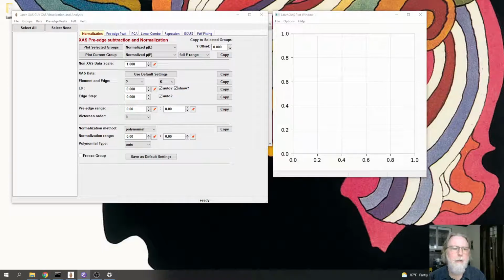One of the most convenient ways is to start with a crystal structure. You don't have to start with a crystal structure if you have a calculation from molecular dynamics or other simulation of where the atoms should be in a crystal or in a glass or a liquid or a molecular structure. That's fine. And for sure, XAFS does not need to be done on a crystal. But in fact, a crystal structure is a convenient place to start because we don't need the structures to be that accurate. We're simulating the local structure.